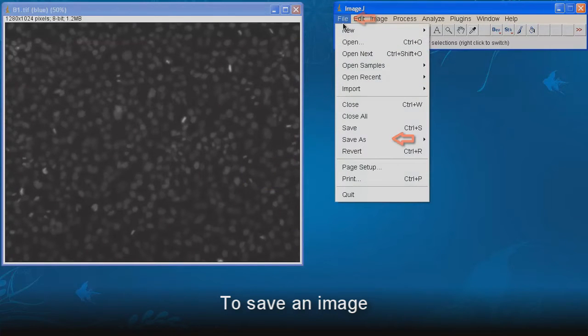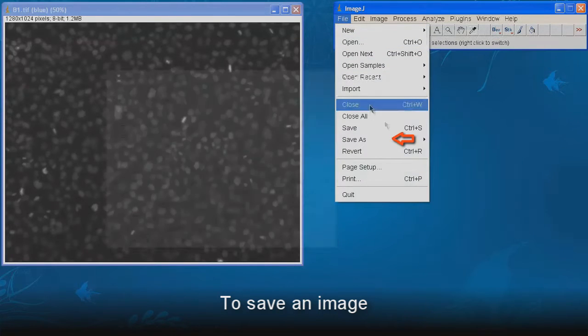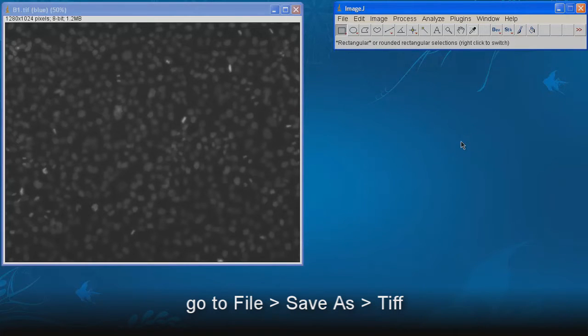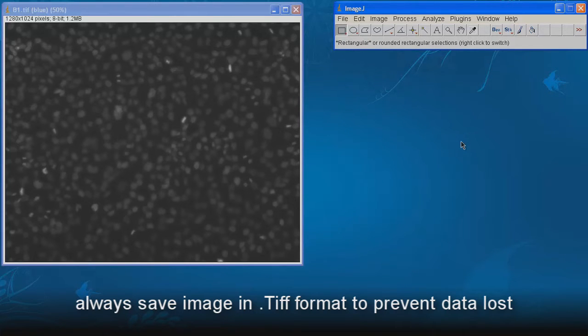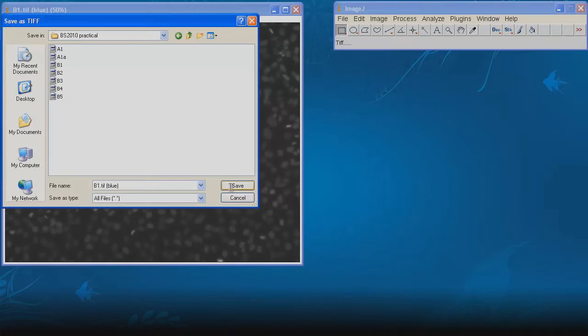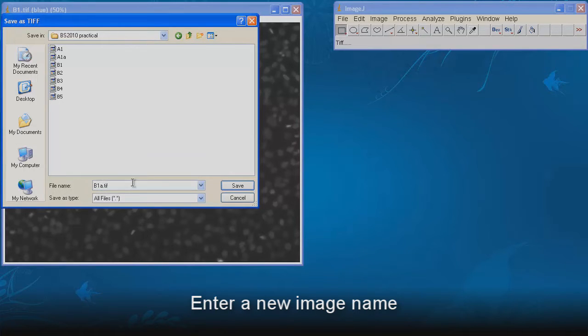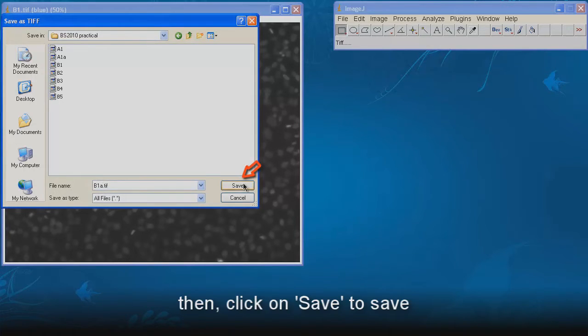To save an image, go to File, Save As, TIFF. Always save image in TIFF format to prevent data loss. Enter a new image name, then click on Save to save.